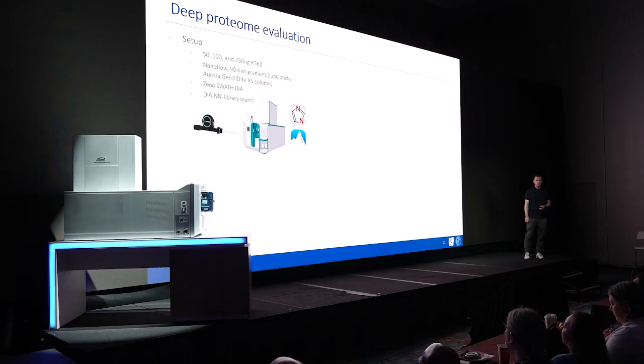So in conclusion, for label-free quantitative analysis, you can get very good CVs and also good accuracy with a good depth, albeit you have to go to longer gradients to fully see this effect. So now that mixed species look nice, the question is how much can we get for a single organism, so a single human proteome.